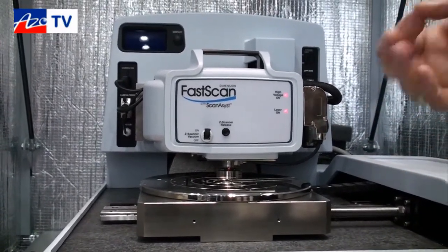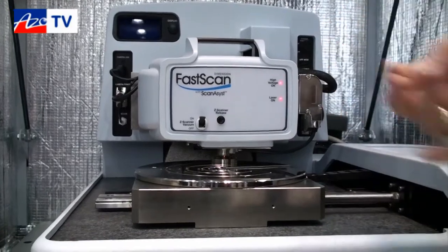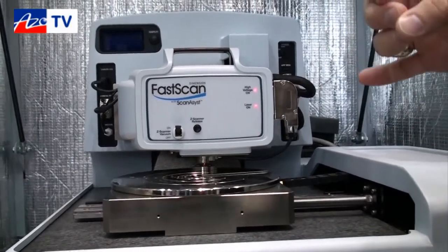It works in contact mode, tapping mode — primarily tapping mode — but also in peak force mode. Those are the two main modes we use it in.